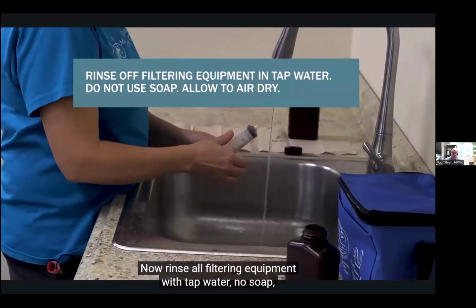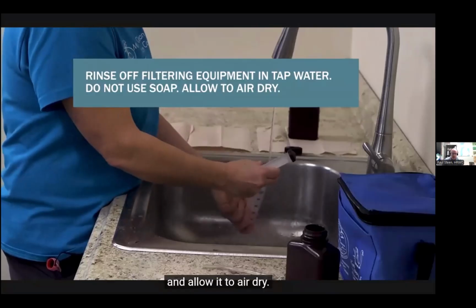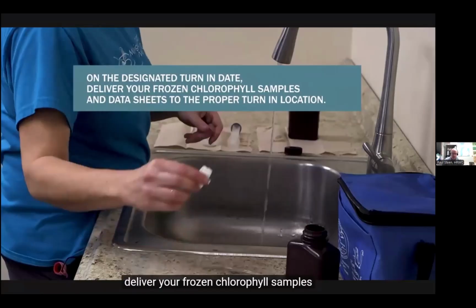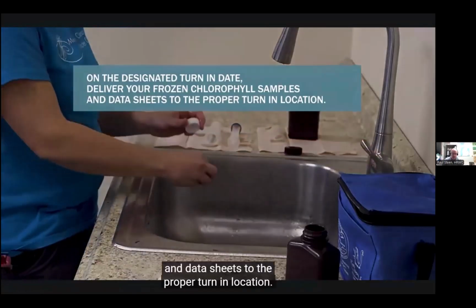Now rinse all filtering equipment with tap water, no soap, and allow it to air dry. On the designated turn-in dates, deliver your frozen chlorophyll samples and datasheets to the proper turn-in location.